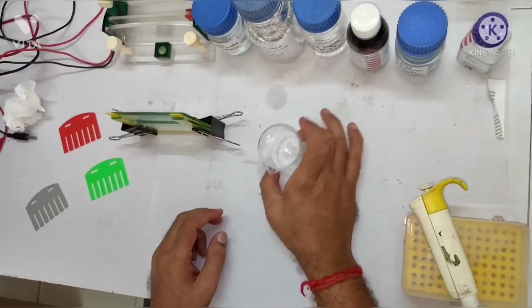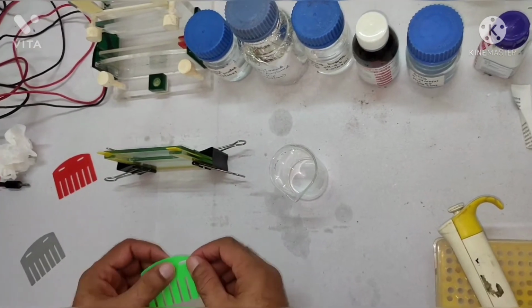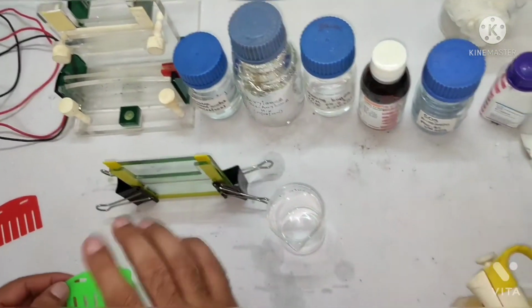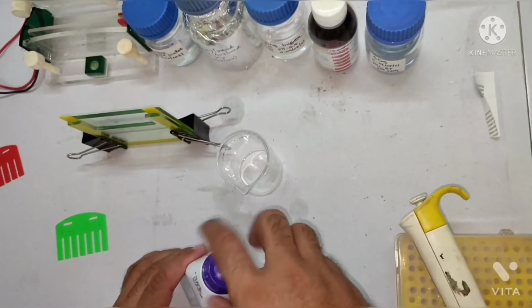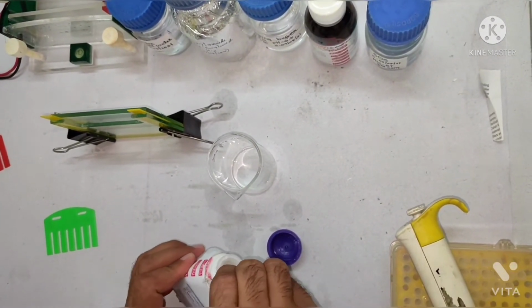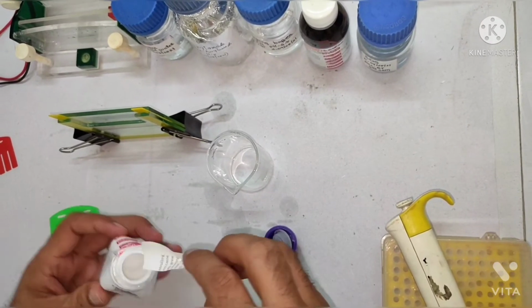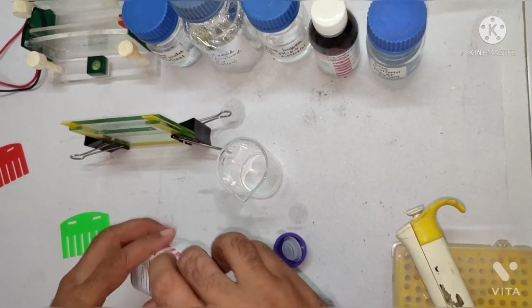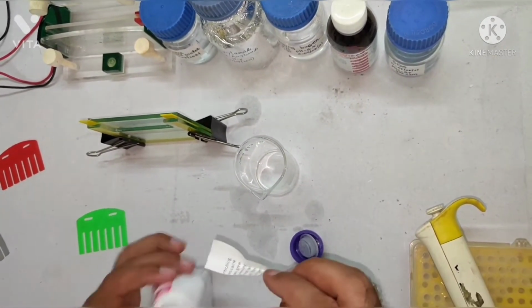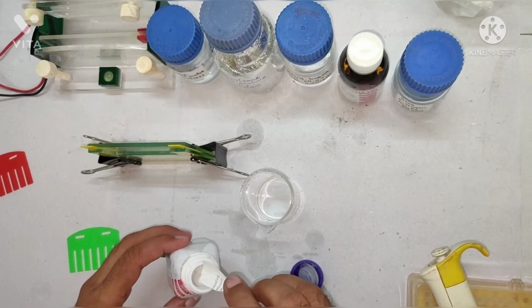The last chemical is APS. Mix it properly; everything should be ready before adding the APS. This is a 1 millimeter thickness comb, so we should place the comb like this here, but before that the comb should be ready. So the comb is there with us. Now this is the APS, so you just have to add a pinch of APS. Take the APS now. See, this is fair enough.